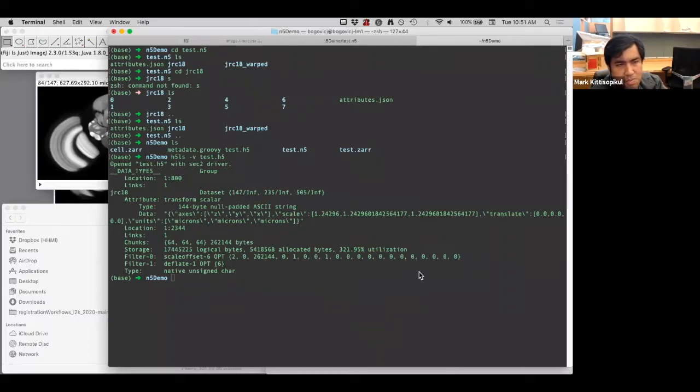There is something called BSON, and I'm wondering if that would be useful, because I think it's somewhat interchangeable. It's meant to be interchangeable with JSON, but it is a binary format, not ASCII or Unicode text, and that might be useful in encoding these floating point numbers without losing precision.